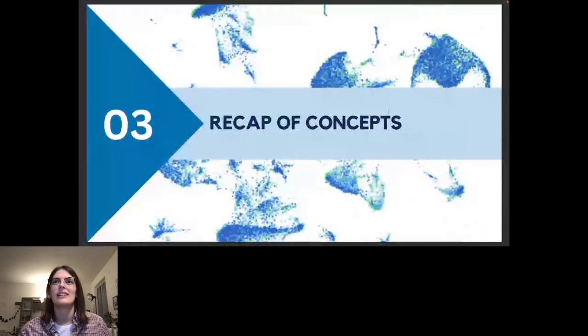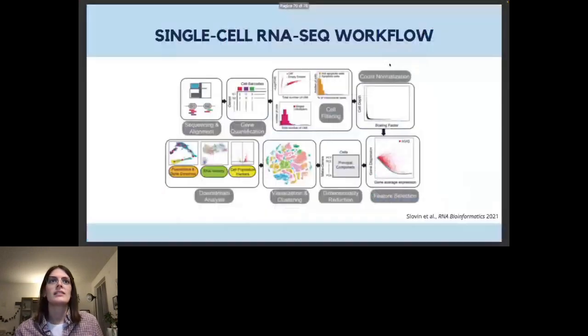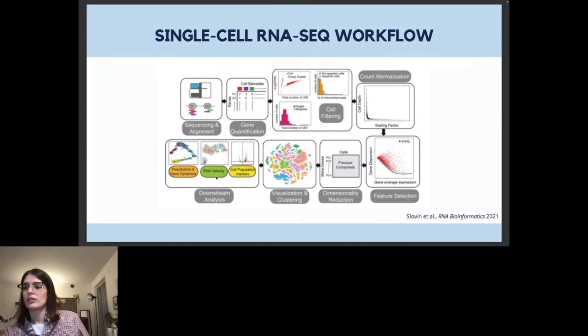So, if we have no other questions, I will very briefly go over the last part of the presentation. So far, no other questions. Okay, so I will share the screen and I will try to end in max 5 minutes so that you are not late for the rest of your day. So you should be able to see the slides. This again is just the workflow, and we saw basically all this part. Now I will just show you some possibilities for downstream analysis.